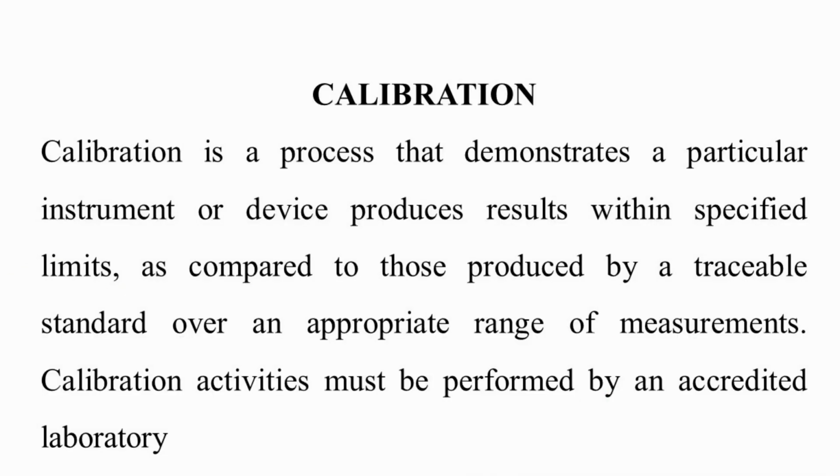Calibration is a process that demonstrates a particular instrument or device produces results within specified limits, as compared to those produced by a traceable standard over an appropriate range of measurements. Calibration activities must be performed by an accredited laboratory.